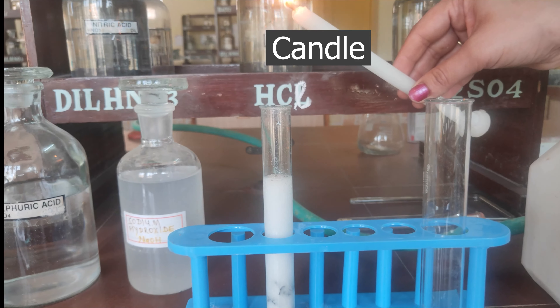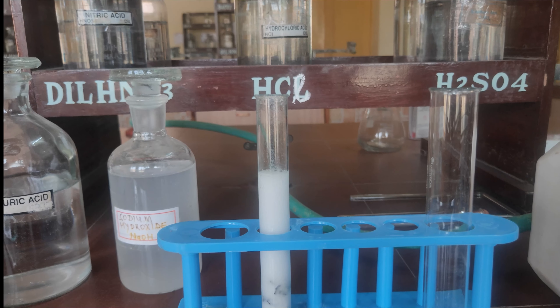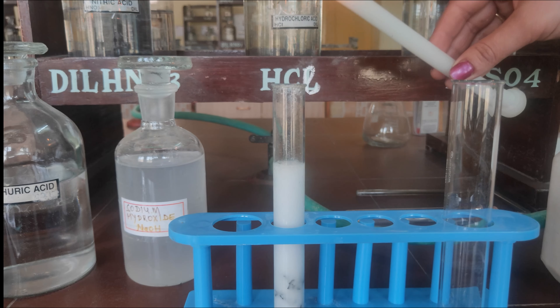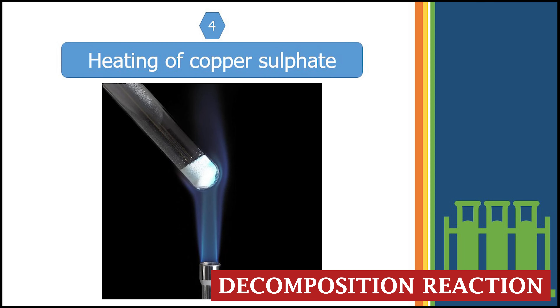Now bring a burning candle near the mouth of the test tube. On bringing the flame near the mouth, the hydrogen gas burns instantaneously with a pop sound.